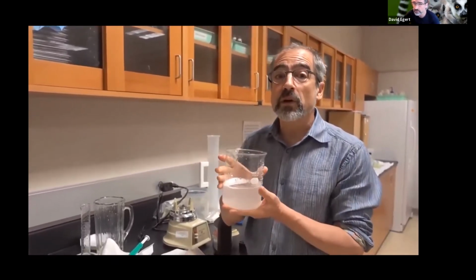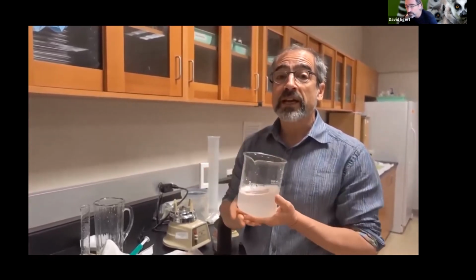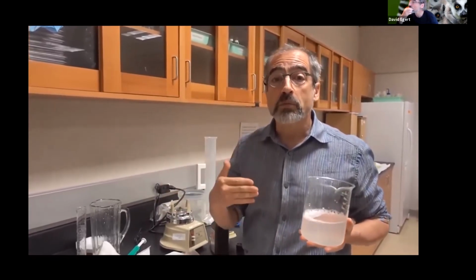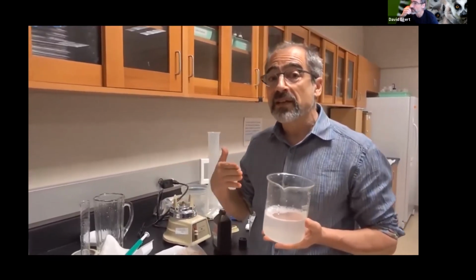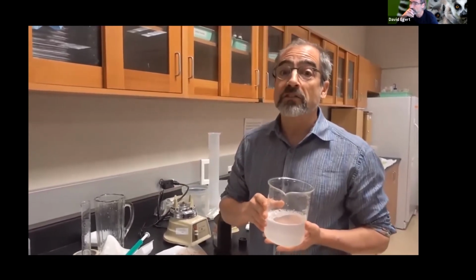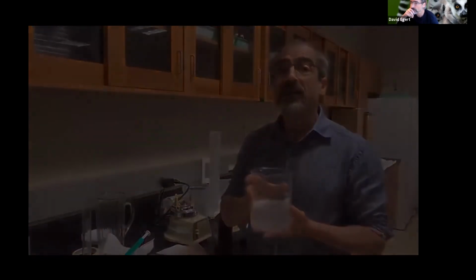So we are going to now take our diluted enzyme solution. We're going to check it out with our whole protocol and make sure that the activity is in a range that's fast enough that you're not just sitting, waiting around and getting bored, but not so fast that the reaction happens before you have a chance to measure stuff.